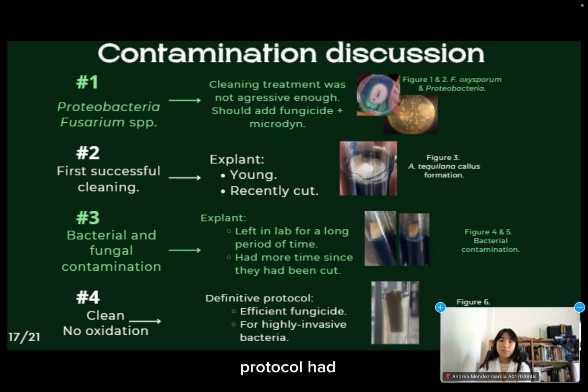Then the following protocol had complete contamination, which was attributed to possible infection acquired from the laboratory they were stored in, and the fact that plants had been cut for a longer period of time. Finally, by widely increasing the amount of time of the fungicide treatment, we got rid of all fungal and apparently bacterial contamination.